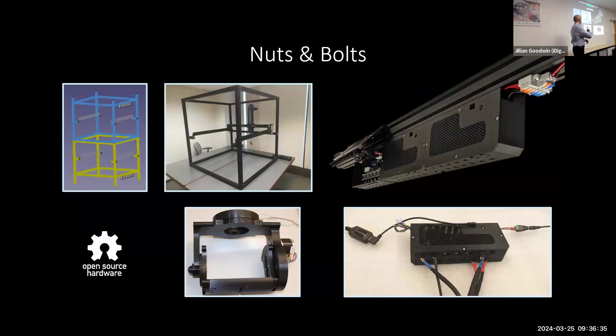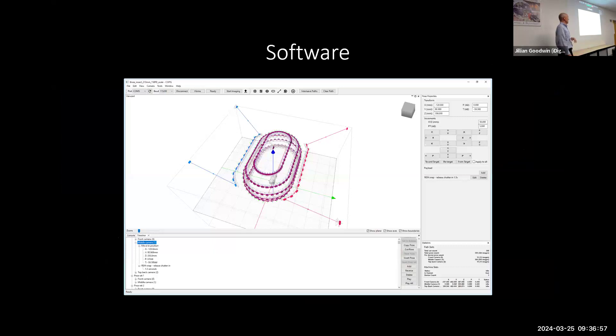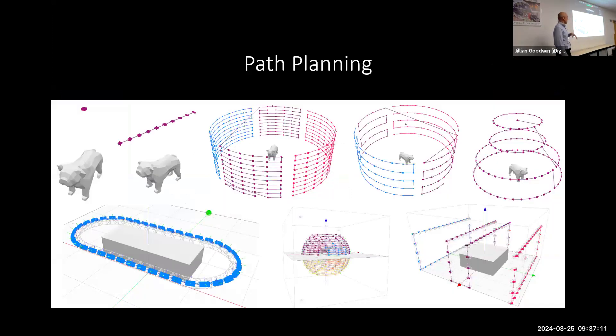Here is a two-chamber setup, which is what we have at the MCZ at Harvard, and this is the setup here at the Peabody with electronics and camera cradle. It's all open source hardware — you can go to GitHub, download all the designs, and start using it. The software is also on GitHub. Here's one of the more complicated paths, using three cameras going around doing elongated flips around an object. The most efficient path we've been using takes approximate measurements of the specimen — length, width, height — and creates a path keeping the camera a certain distance from the plane of focus. This avoids relying on autofocus, which is very problematic for insects.